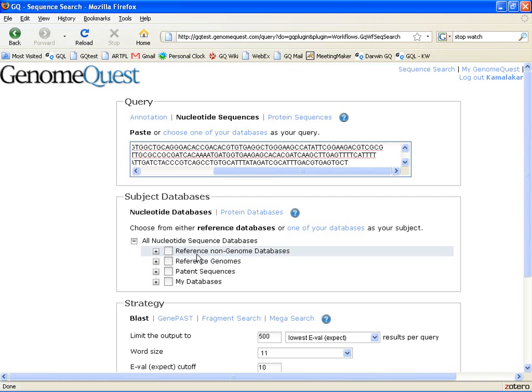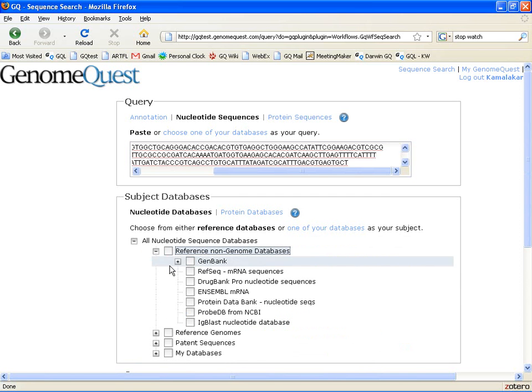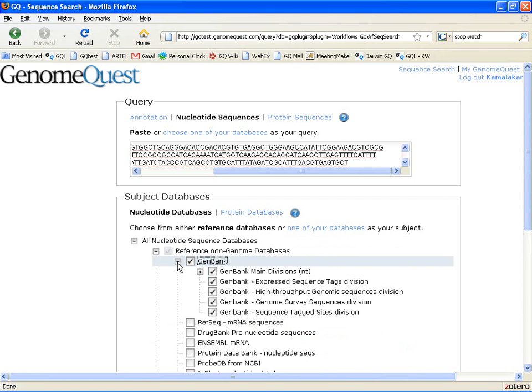The second step is to choose subject databases. In this case, we'll choose GenBank, which includes all the main divisions and non-main divisions of GenBank, which you can open and take a look. We'll also choose RefSeq, which is a reference sequence database well curated at NCBI.